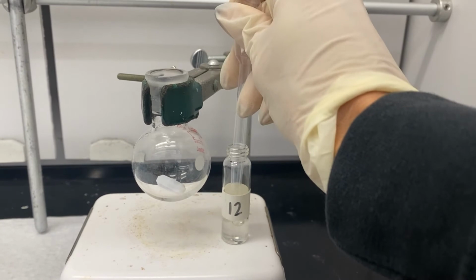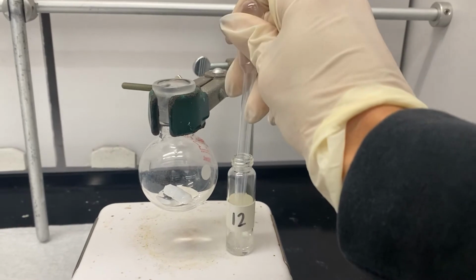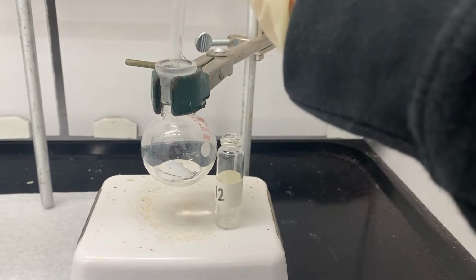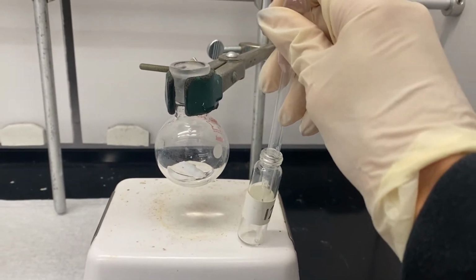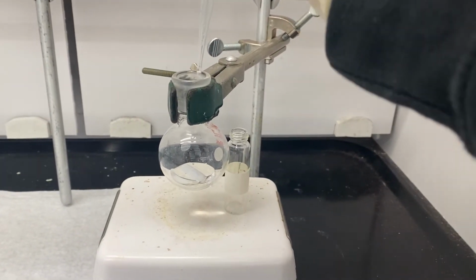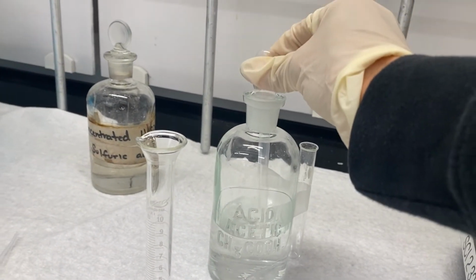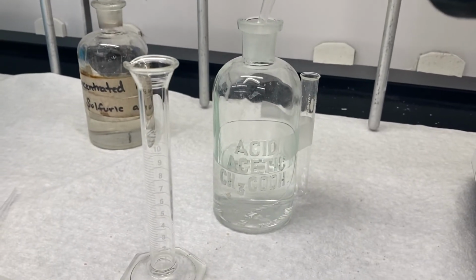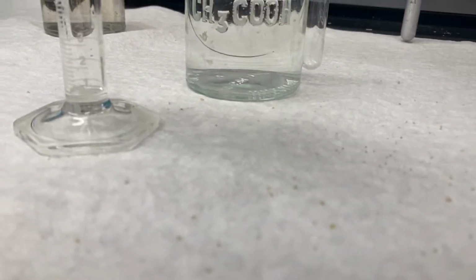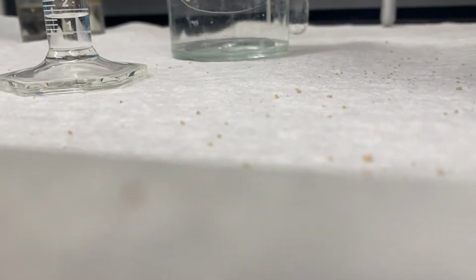So we're going to add our alcohol, and it's already pre-measured for us. So we're going to add the full contents of the vial. And we want to add acetic acid in a 1-to-1 ratio, and that comes out to about 2.75 milliliters. I'm just going to use a graduated cylinder to measure that out.